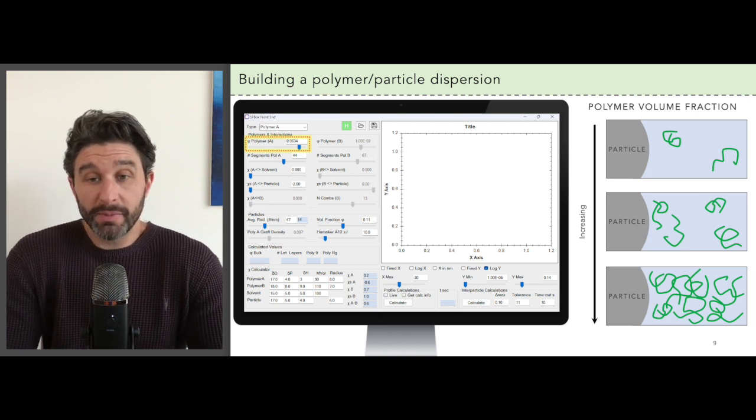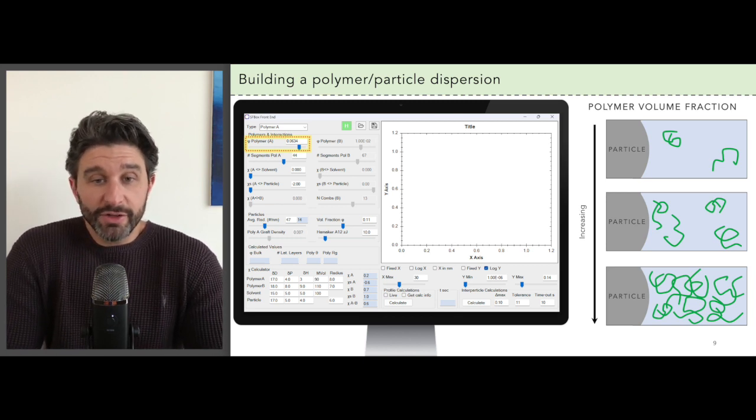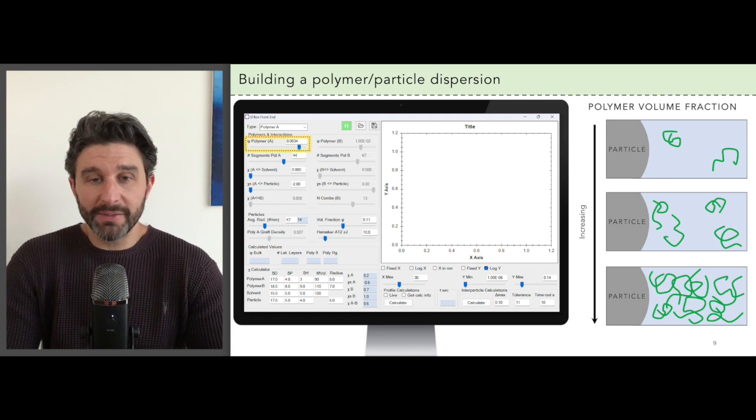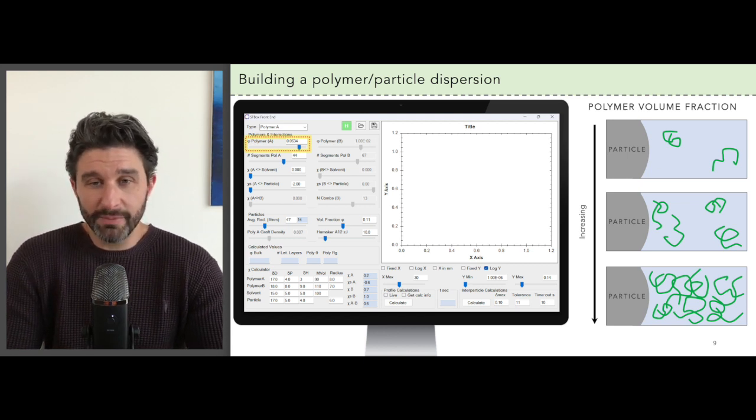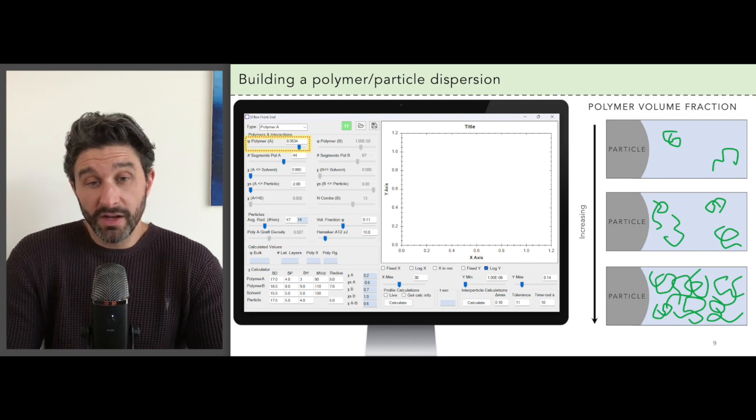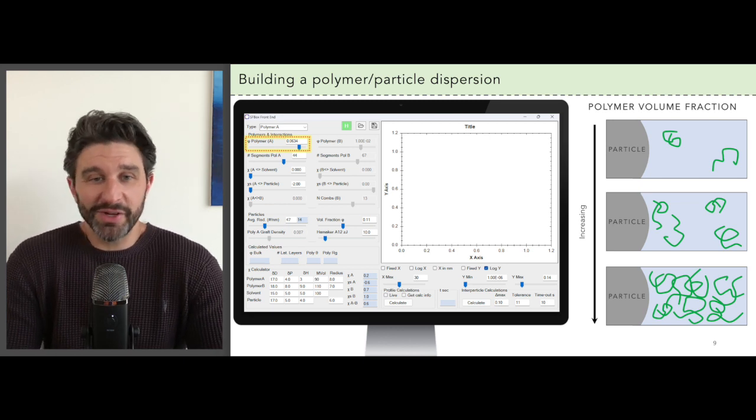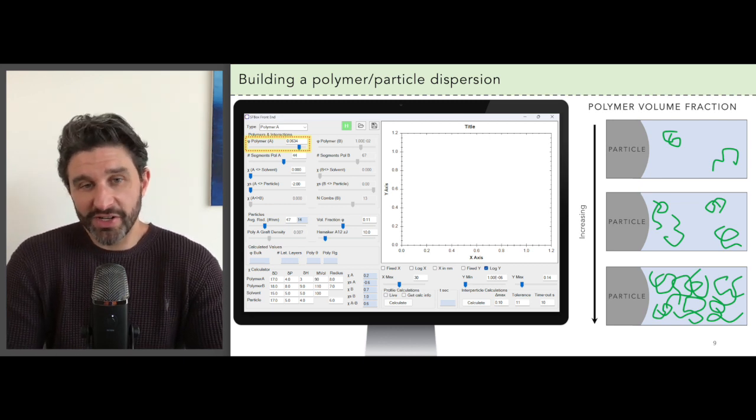The first parameter is the polymer volume fraction. This tells you of course the amount of space that's occupied by the polymers in the solvent. It's just the concentration of the polymers times the polymer length. Obviously if you increase the volume fraction, that means there's a larger concentration in your solution.